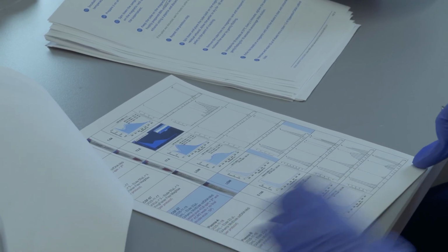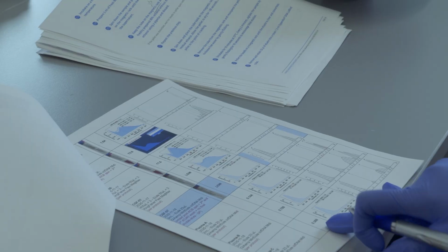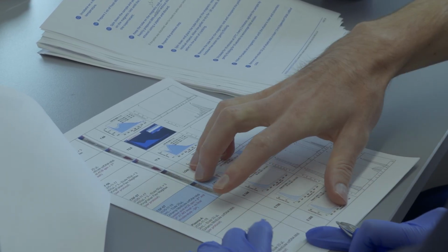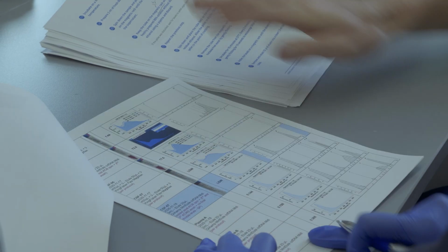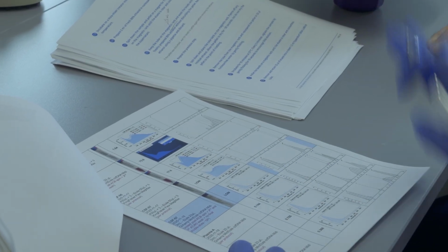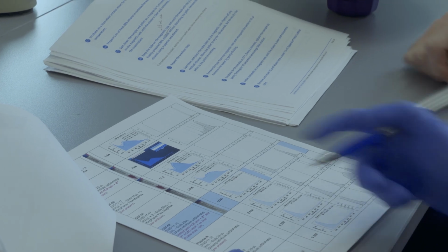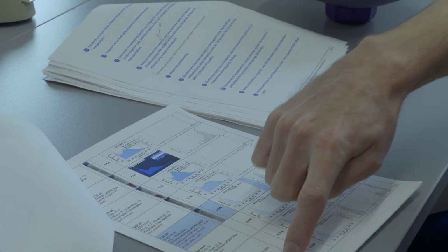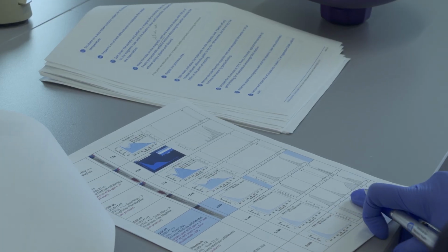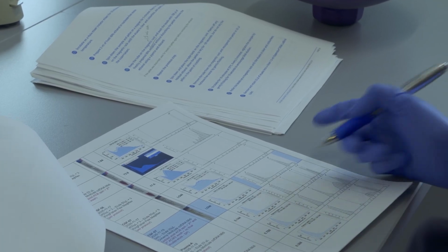So the question here is, maybe because of multiple washes? I don't know what the difference is. This one we only did once. This is each individual sample per this exact protocol, so no washes, not replicates, no wash difference. These are different samples: person A, person B, person C. I see. Okay. Here, this is the correct peak, I believe, right?